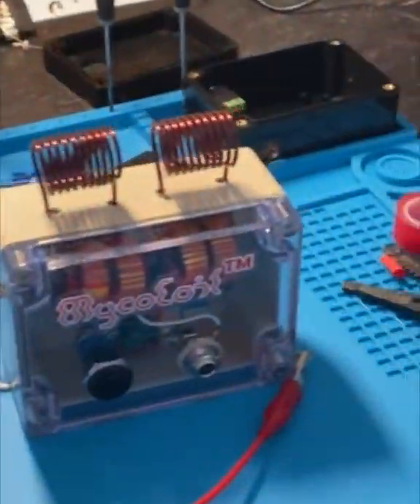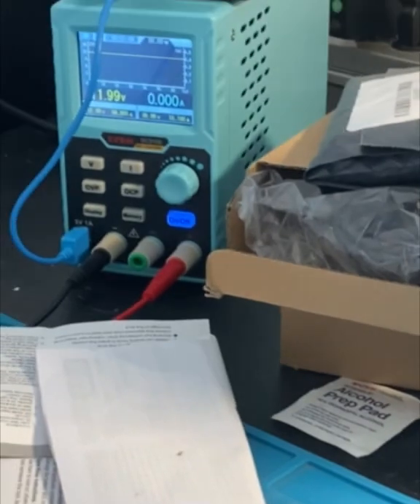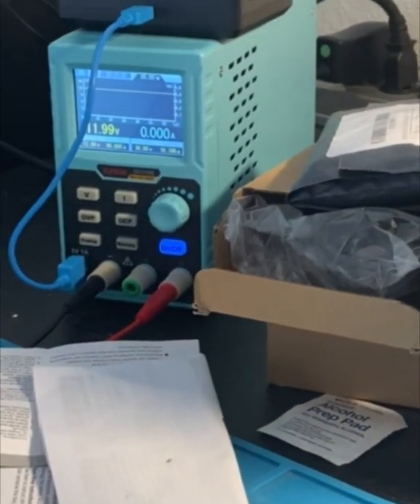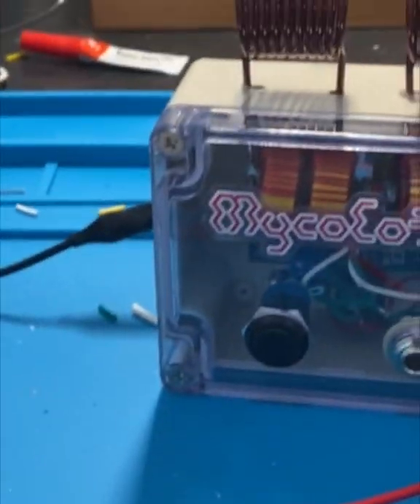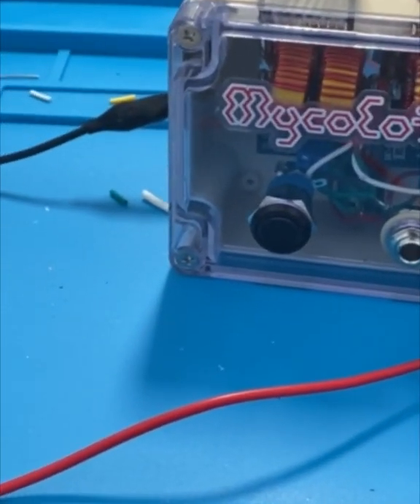What's up fam, this is a prototype product demo for the MycoCoil Deluxe. I got it hooked up to the power supply, programmed for 12 volts and 10 amps, just like a regular power supply. I want to see how much current it pulls.